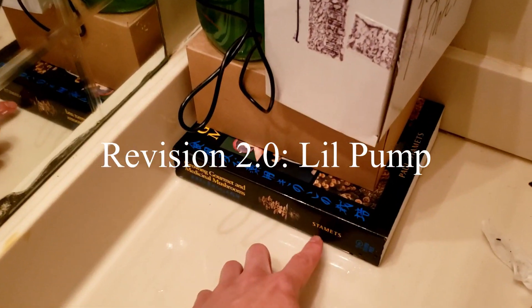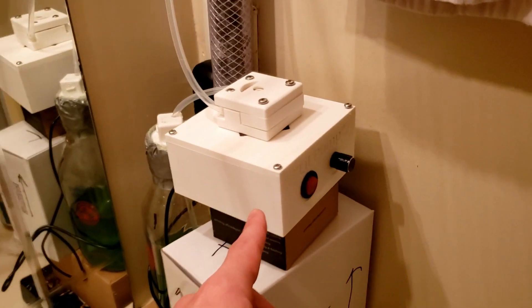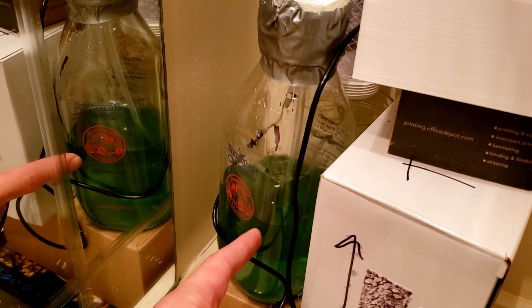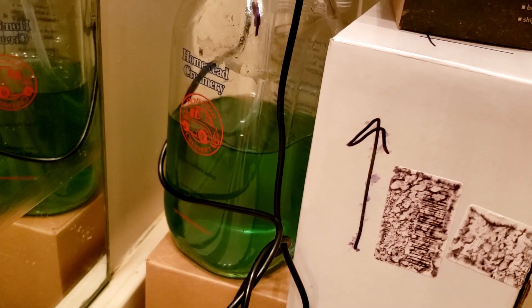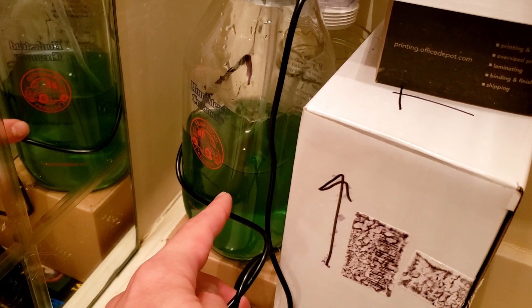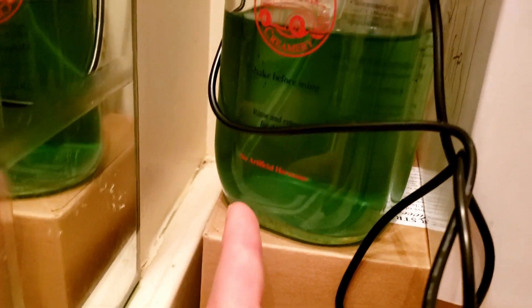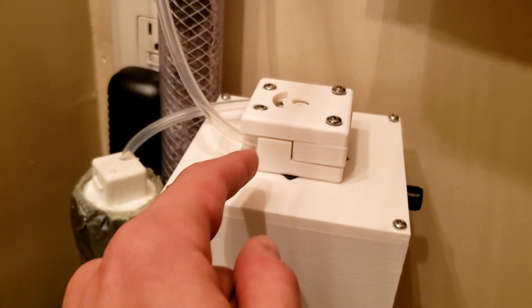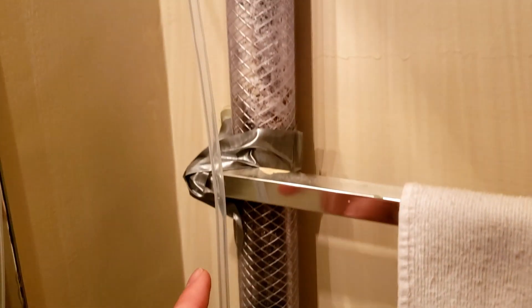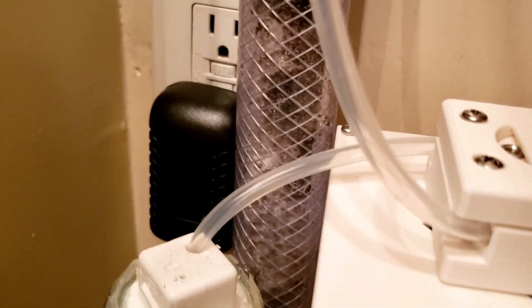This setup is blessed by Paul Stamets on the bottom. I've got my agar plates in this box, some business cards, and the peristaltic pump. The broth I used previously was stored in the refrigerator, and I didn't see any contamination. I had to make the hole bigger, so there's some PVC plastic in there — everything's fine. This broth has been sitting for about 10 days, so it might be contaminated, whatever. The inlet tube goes almost all the way to the bottom of the reservoir, into the pump, and comes up and down into the reactor tube. The mycelia is still growing, with good amounts at the ends of the tube.